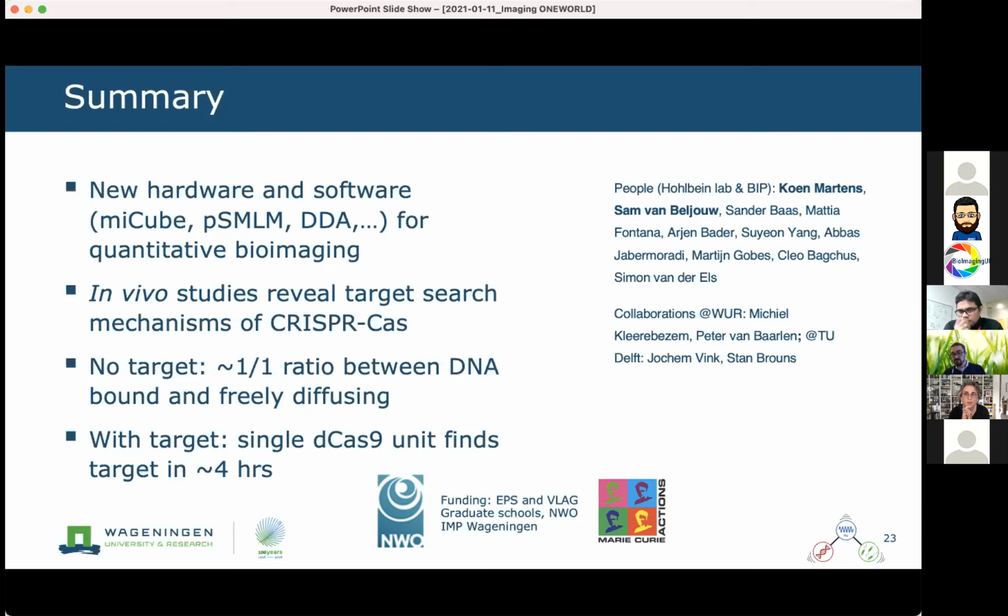You have experience of also commercializing, like the Oxford Nano Imager, which is a really nice example of a very innovative small system. Yeah, I have not much to do with that other than I was in Achilles' lab for a while. Yes, but it is a very closed system. Yeah, so this is always the trade-off. Do you want an open system where you can change everything, or a system for running a facility where you don't want people to change too much?